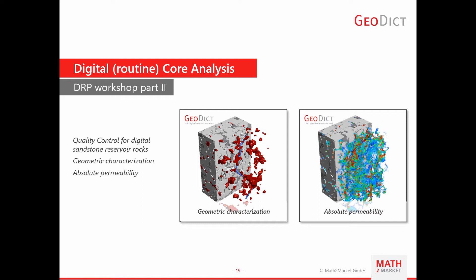Welcome back to part 2 of our Digital Rock Physics workshop. We will start with a basic or routine digital core analysis. Topics will be quality control for our digital sandstone geometry, geometric characterization, and determination of the absolute permeability.